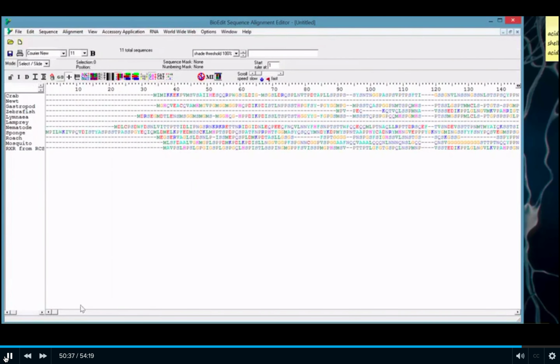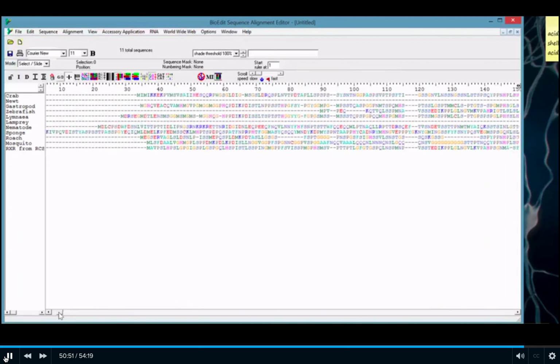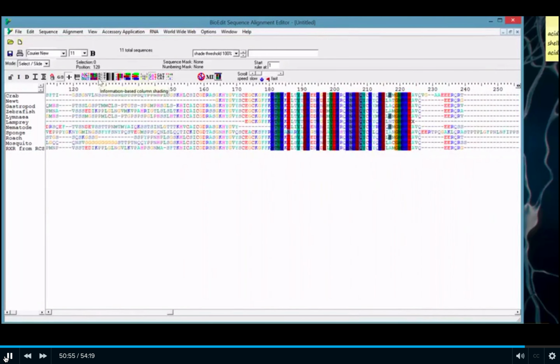So I can search through this, and clearly I've got a wide range here, right? I go from mammals all the way down to, say, crabs, and gastropods, which are like snails and slugs. So I kind of have the entire animal kingdom quickly represented. By changing the different display properties here, I can get different sorts of representations. This particular one shows what's common across everything.